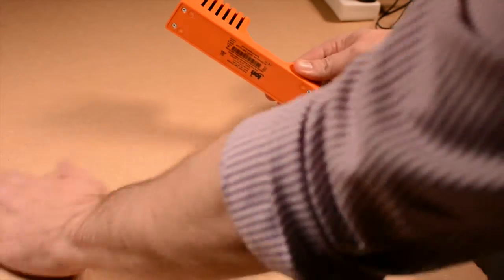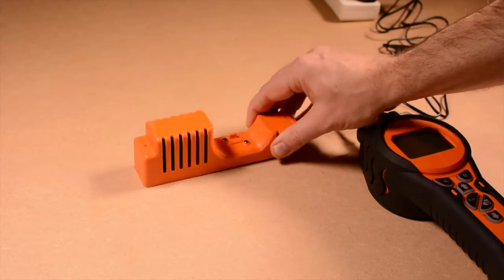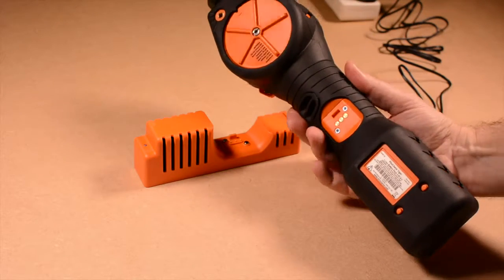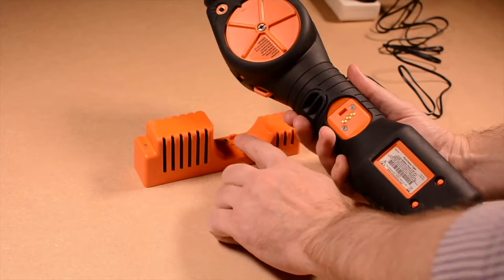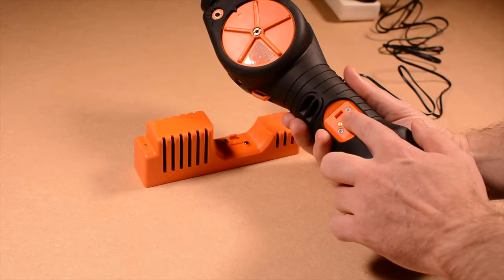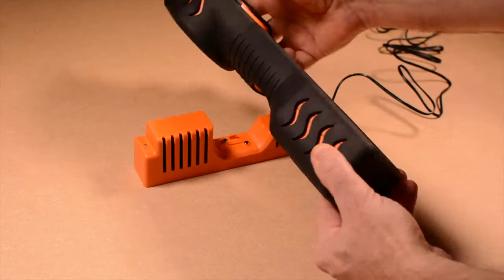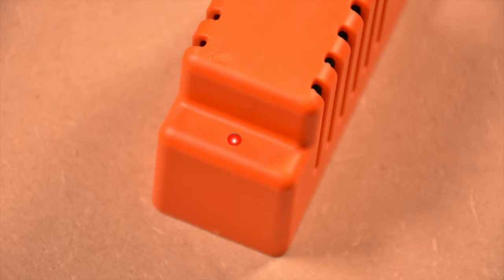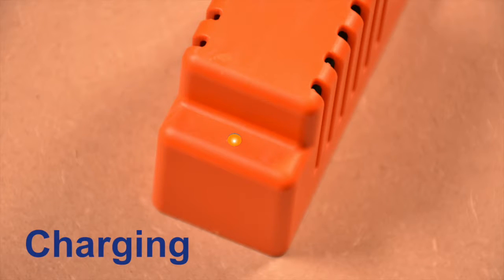Place the charge cradle on a flat surface with the LED to the left of the instrument. Align the location post on the charge cradle with the recess in the back of the instrument. The Tiger instrument should just drop into place. The LED on the charge cradle will change to amber. The instrument is now charging.